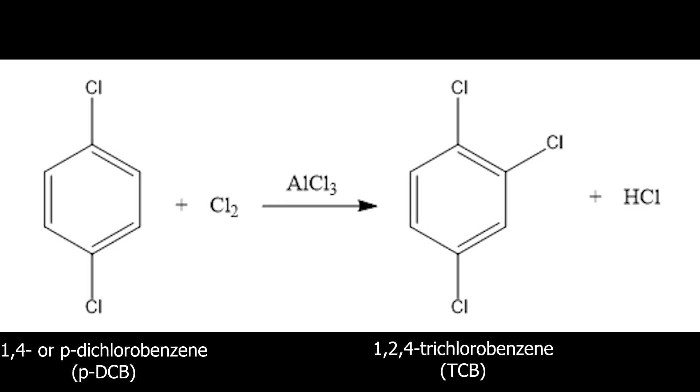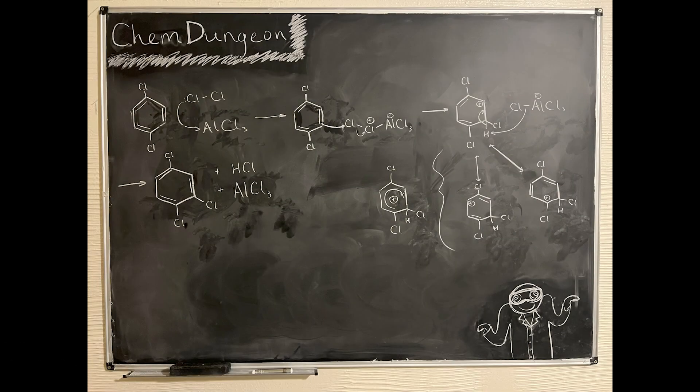In this video, I'm going to be further chlorinating PDCB to TCB using anhydrous aluminum chloride as the Lewis acid catalyst. It's analogous to the electrophilic aromatic substitution mechanism for the previous two chlorinations, so I'm not going to go into it.